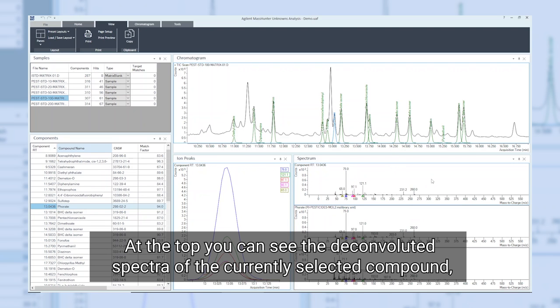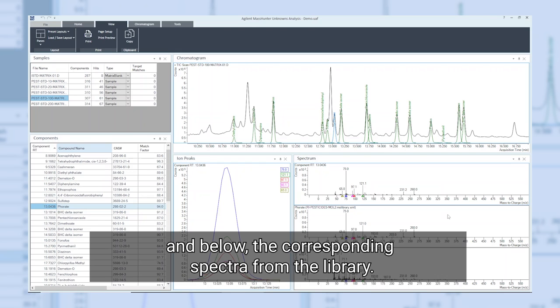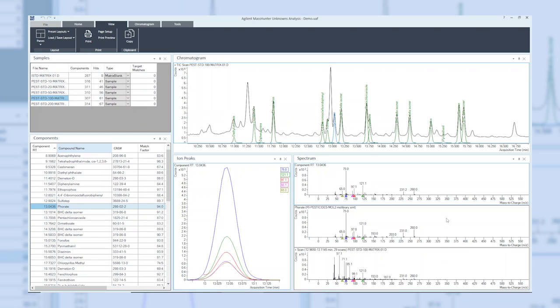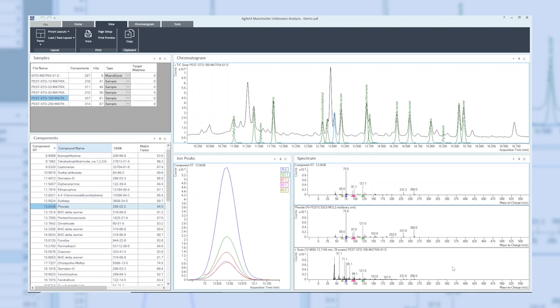At the top, you can see the deconvoluted spectra of the currently selected compound, and below the corresponding spectra from the library. At the bottom, you will find the raw data at this point in the chromatogram.